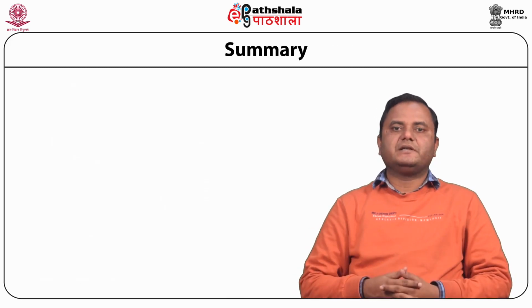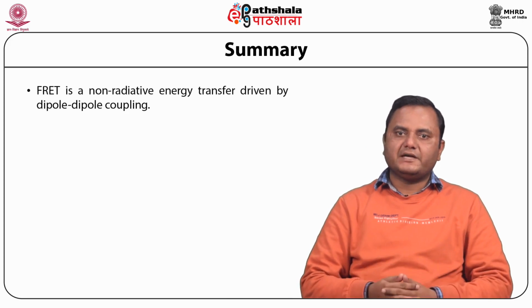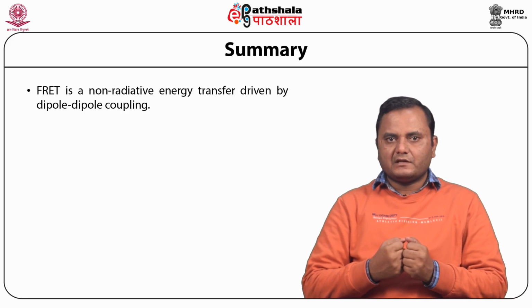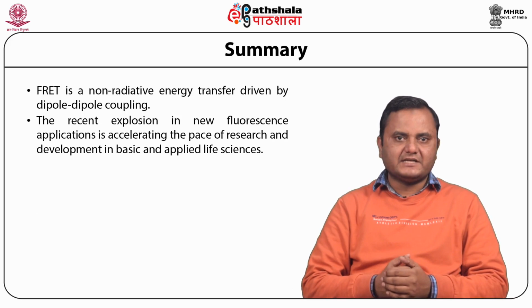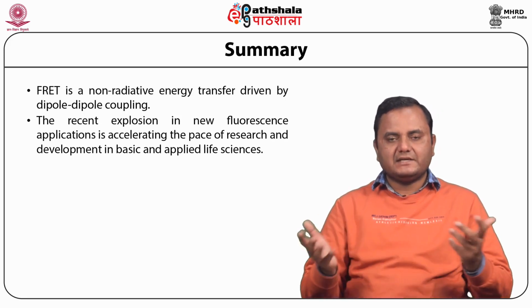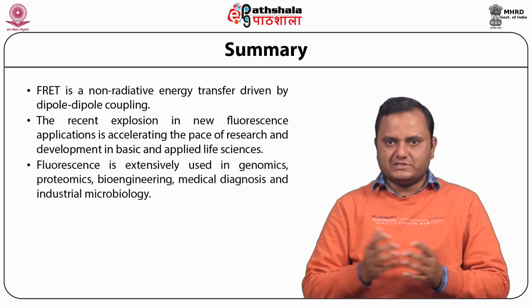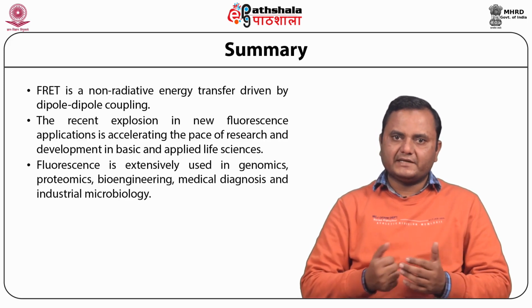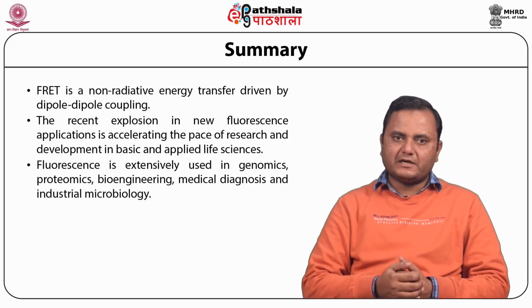So students, let's now summarize what we have learned in this module. FRET is a non-radiative energy transfer given by dipole-dipole coupling. A recent explosion in new fluorescence applications is accelerating the pace of research and development in basic and applied life sciences. Fluorescence is extensively used in genomics, proteomics, bioengineering, medical sciences, especially medical diagnosis, and industrial microbiology.